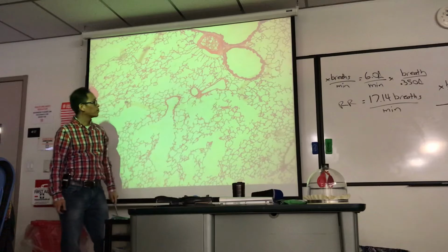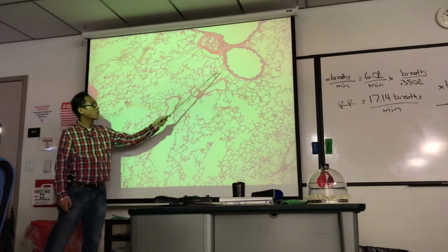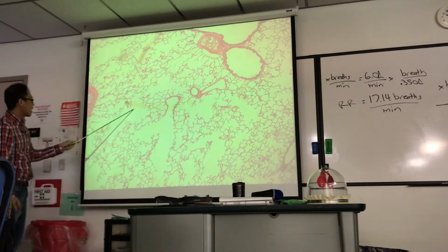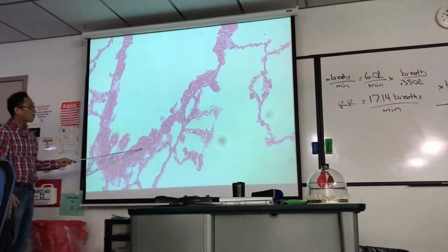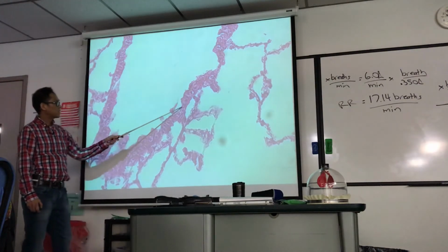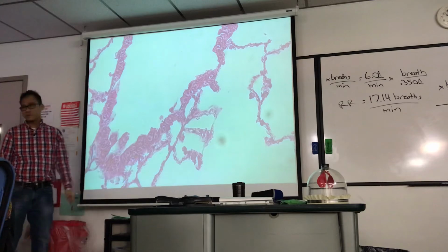That's a good one. Right, so anytime you see it has a thickened wall like that, or that, or that, it's all bronchiole. If it looks like a hallway, alveolar duct. Here's a close-up picture of the wall of a bronchiole. Just call it a simple cuboidal epithelia. There may be cilia there. I don't see too much there. Maybe sparse cilia.